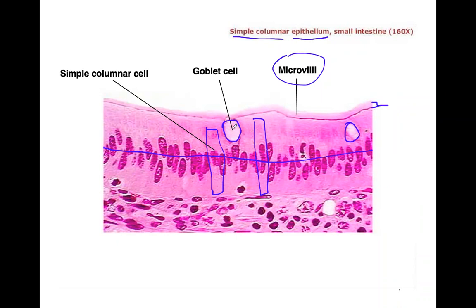So this is going to release or secrete mucus. The mucus is going to stick here. And this is of the small intestine. So all the nutrients are going to stick and they're going to be pulled in to those intestinal cells for absorption.